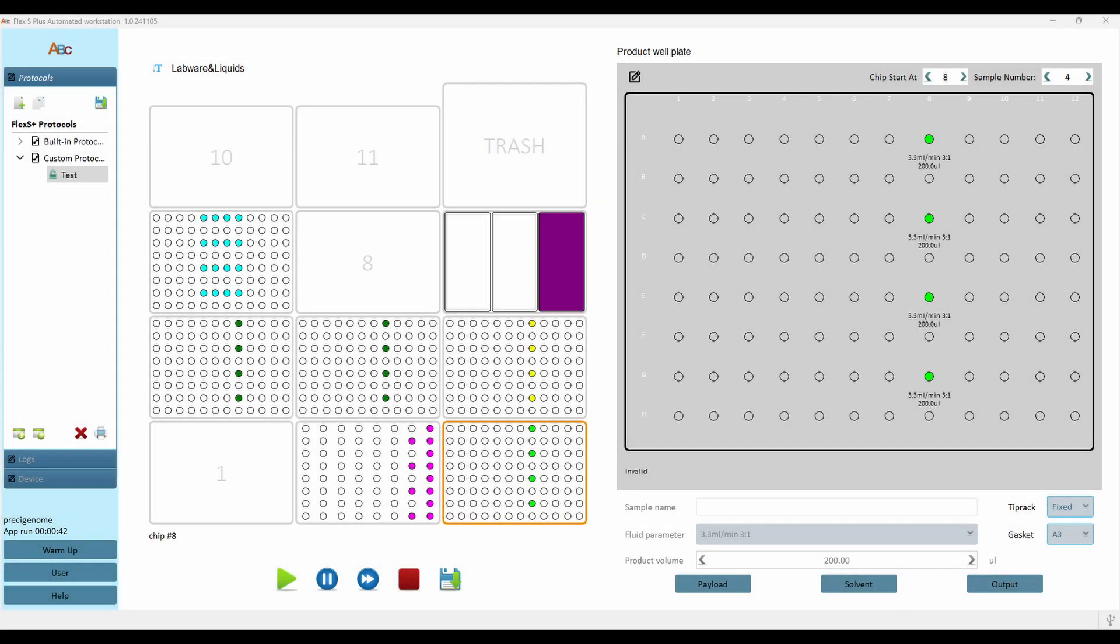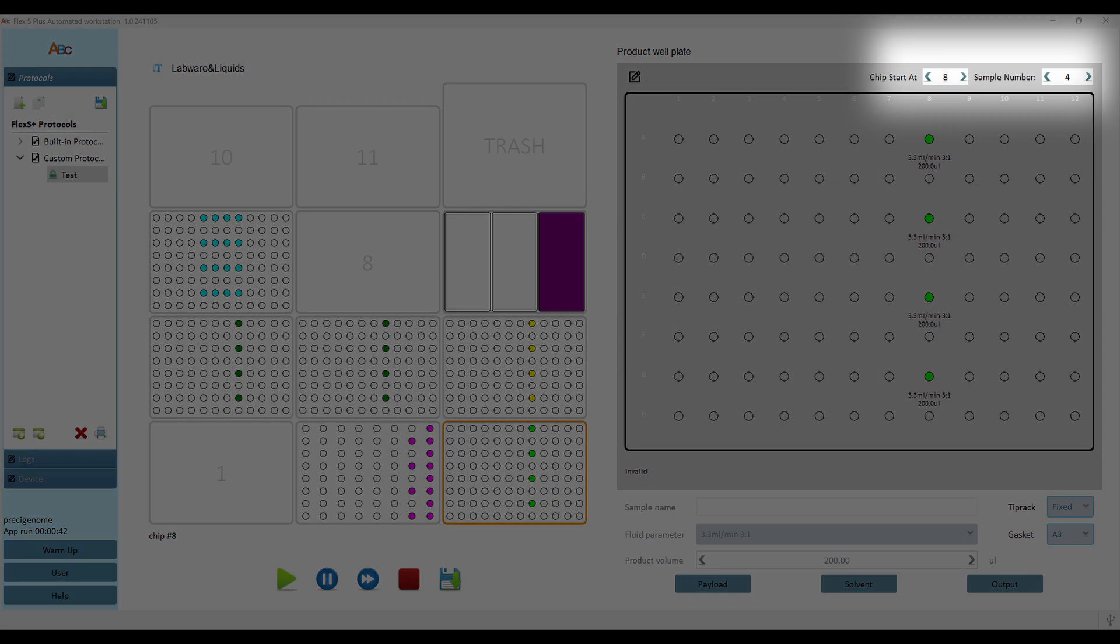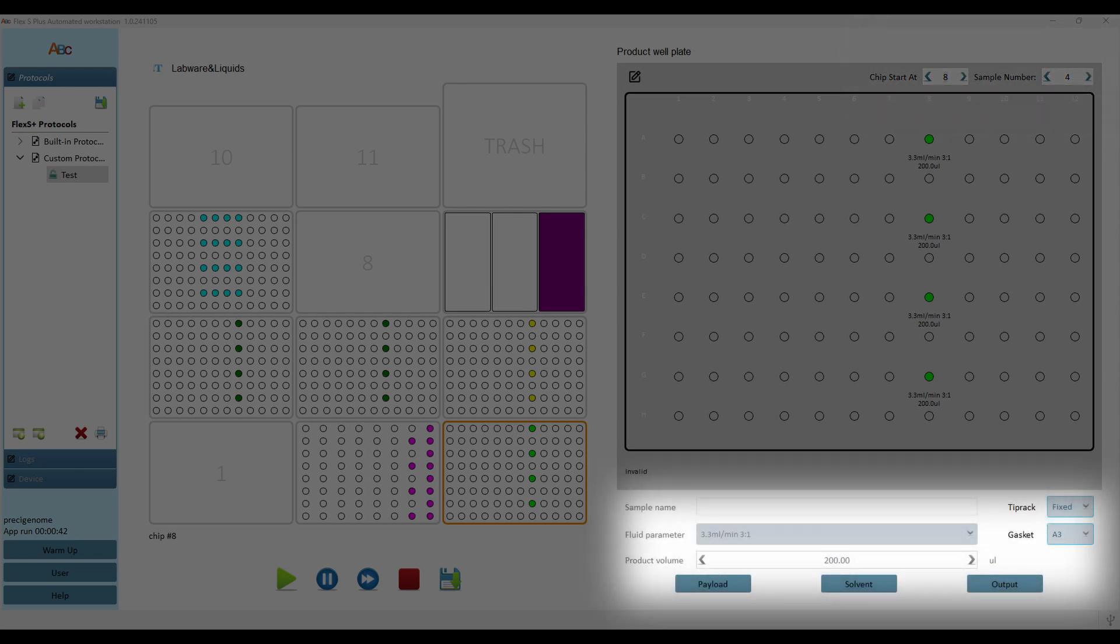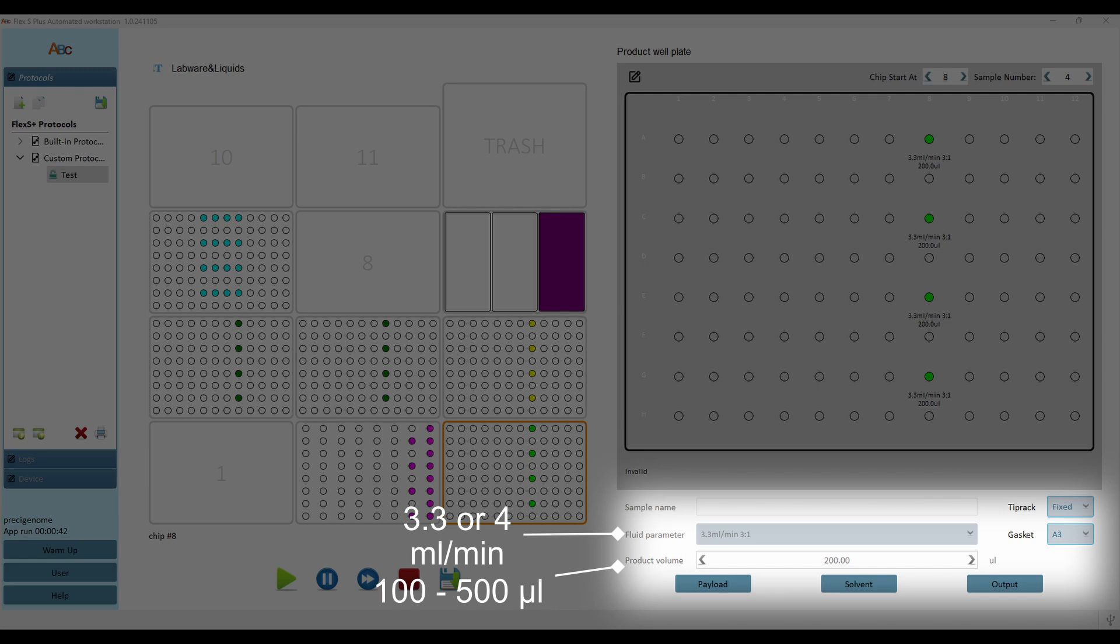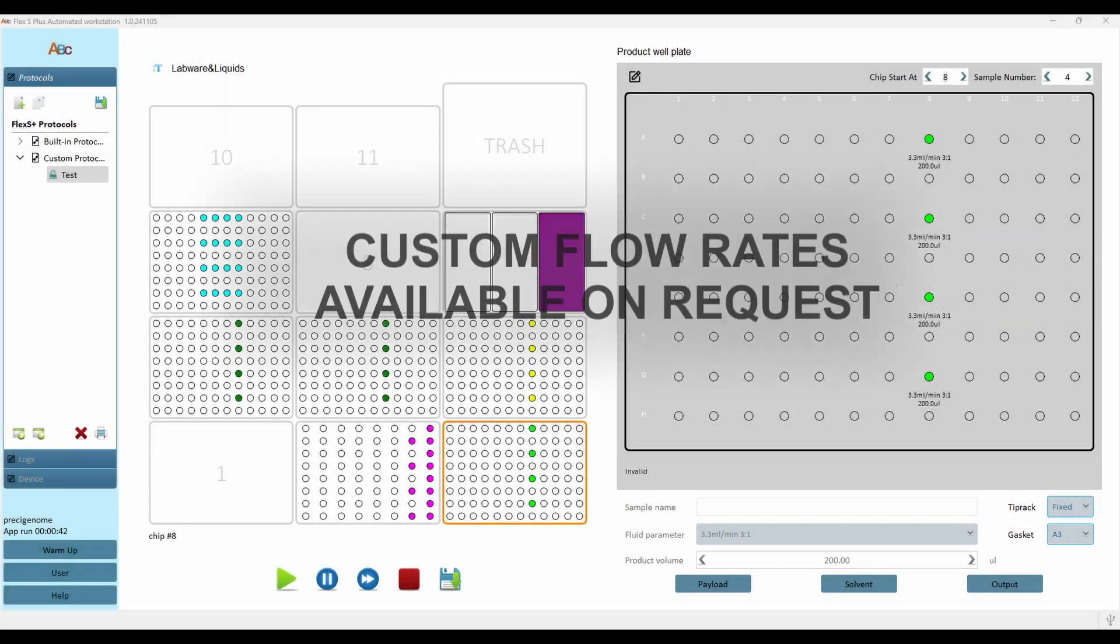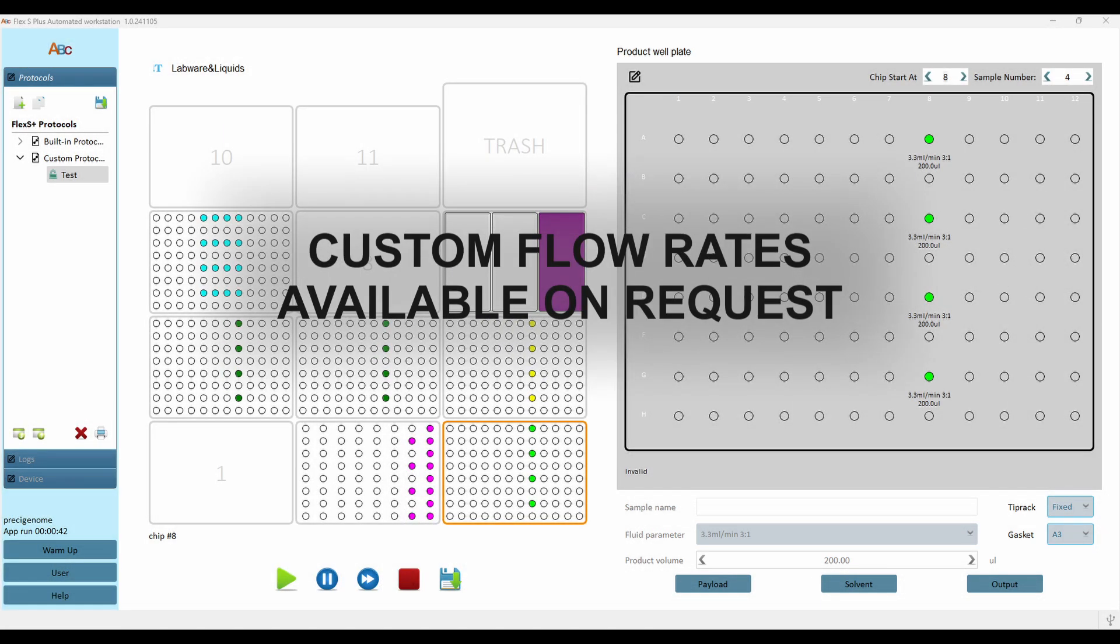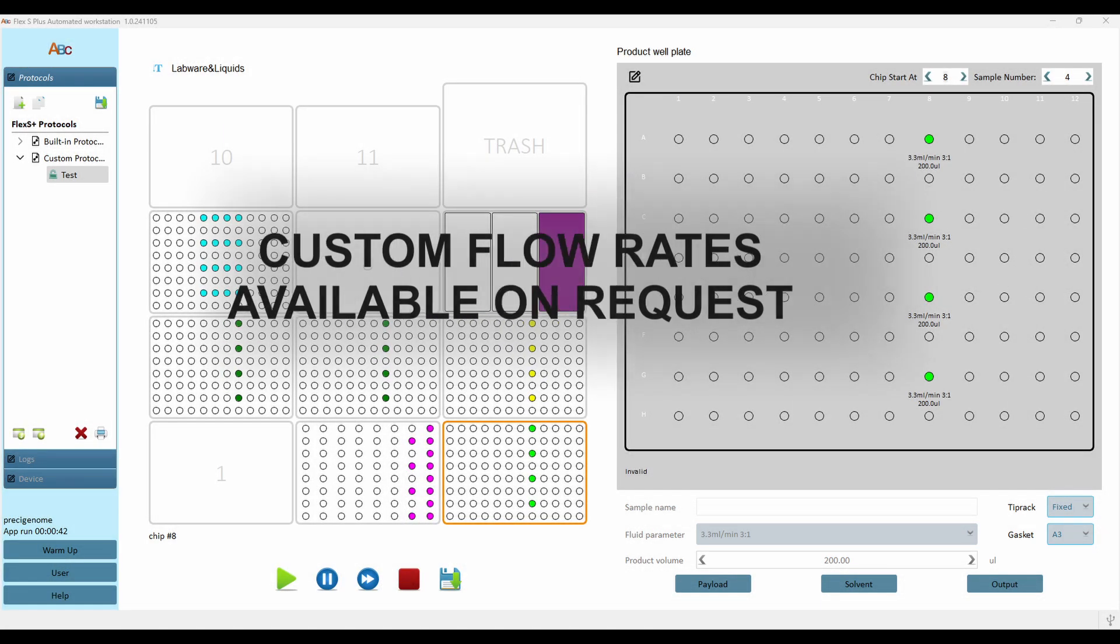Fluid parameters may be customized separately for each mixing chip, and sample count may be changed in multiples of 4. Product volume may be set from 100 to 500 µL, while total flow rate may be set to 3.3 or 4 mL per minute, with 3 to 1 water to ethanol.